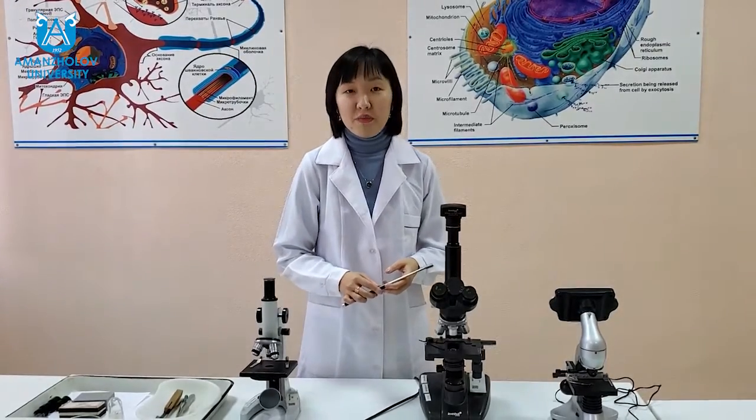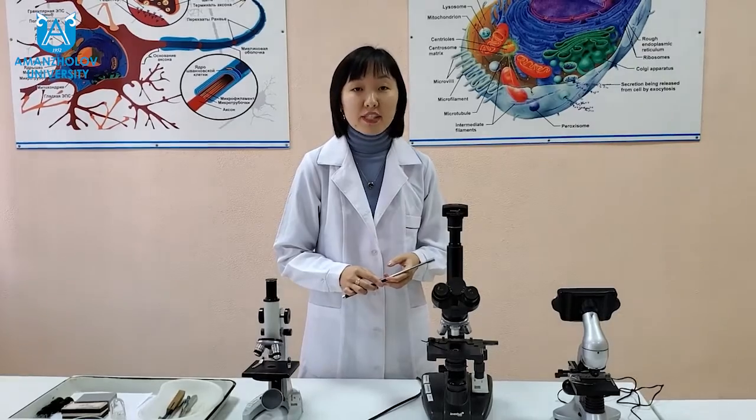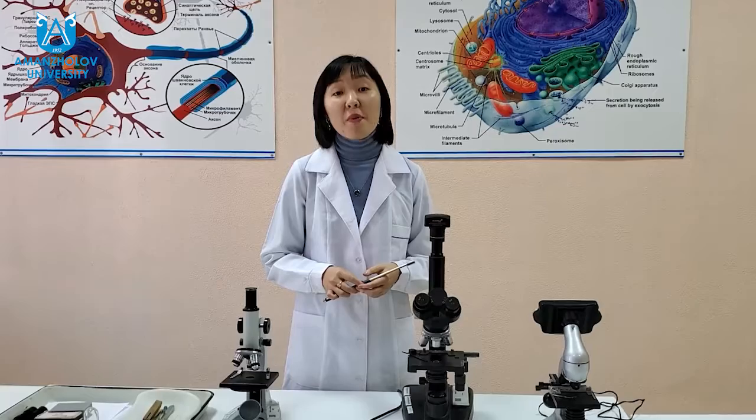Visualizing part, designed to obtain a real image of an object on the retina. The visualizing part is located between the lens image plane and the observer's eye. The imaging part includes monocular, binocular, and trinocular visual attachment with an observing system, eyepieces that work like a magnifying glass.